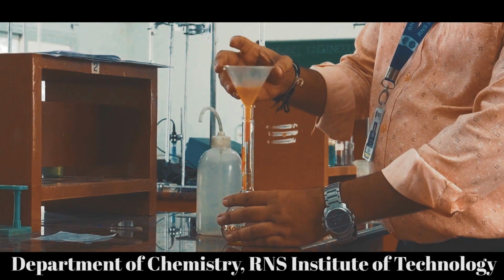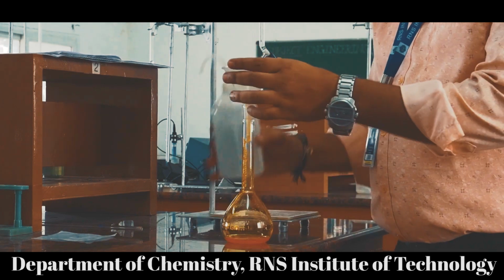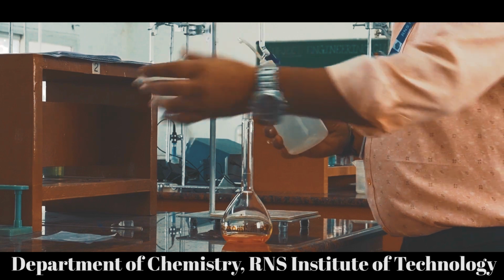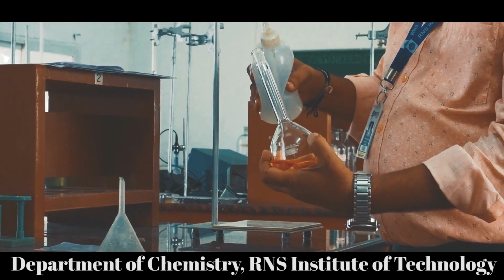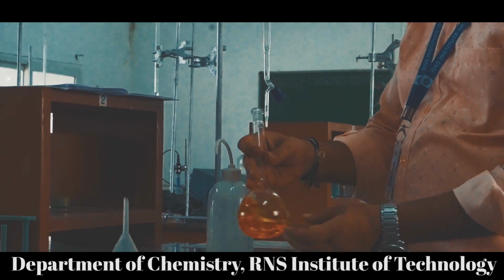It will take time like this. So first add through the funnel. 2 to 3 times you can add, and then you can remove this funnel and add the water through the walls of the standard flask like this. Step by step you can add water and stir the solution because it will dissolve very quickly.